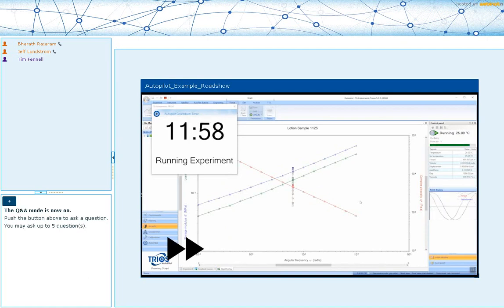And then we notice that the shear rate, the final shear rate specifically, changed based on the input in the dialog box. So the user has an opportunity to override specific parameters. Through instrument operation, a video playback shows them how to load a sample. And again, notice how the rest of the UI is grayed out. So there is no other opportunity to change other parameters in the test except for what was presented in that dialog box.